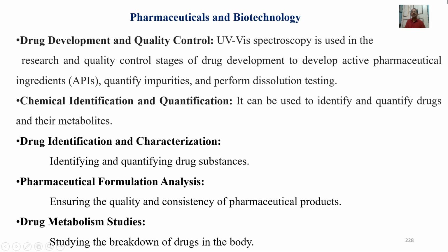Pharmaceuticals and biotechnology. Drug development and quality control. UV spectroscopy is used in the research and quality control stages of drug development to develop active pharmaceutical ingredients, quantify impurities, and perform dissolution testing.